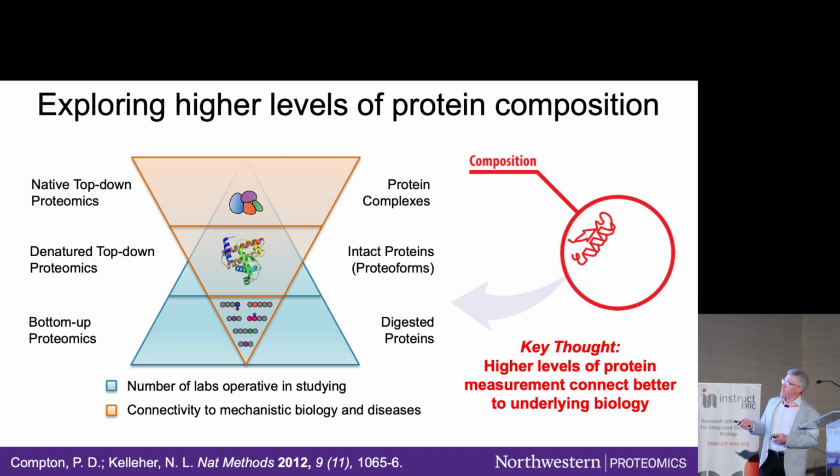So, but for many years, myself and others have been saying, well, for reasons that I just articulated to you, we could go to the next level and have a new unit of measurement, not the tryptic peptide, but the entire proteoform as the unit of measurement.